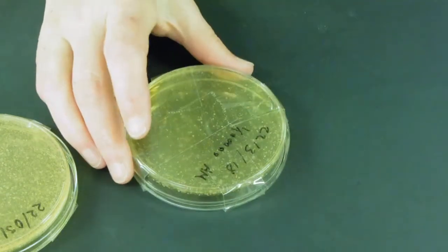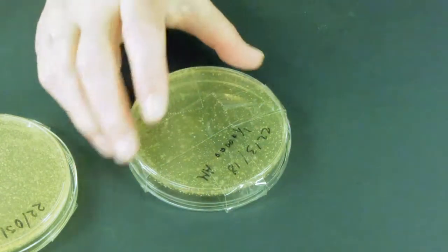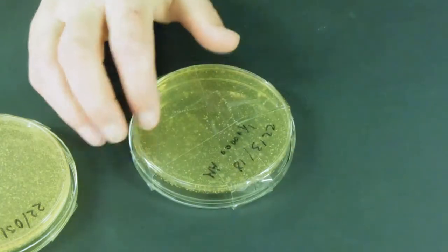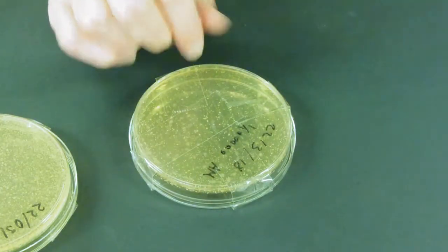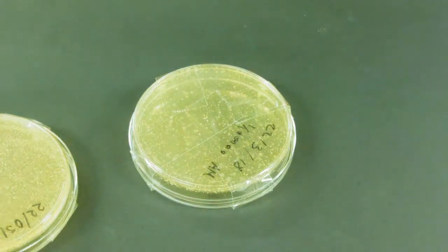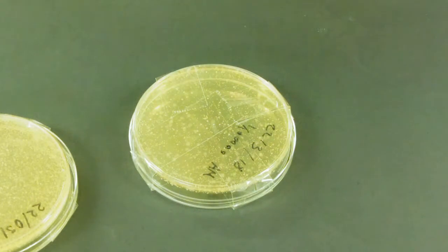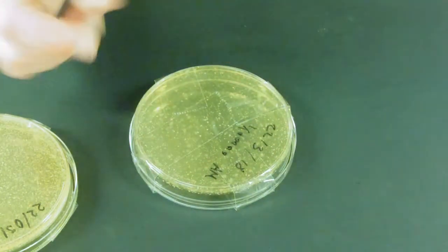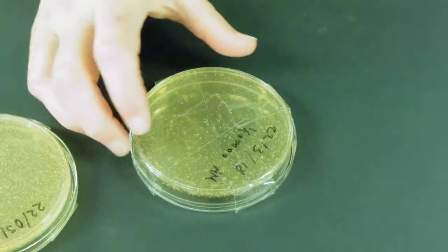What to do once you've counted them, then you need to multiply by the dilution. So, this has been diluted one in a hundred thousand. So, however many you counted, you'd need to then multiply by a hundred thousand to get right back to the start with what you had in your original culture. And, obviously, you need to know the volume, so if we put a tenth of a centimeter cubed in here, we would have to multiply by ten to get it to a centimeter cubed. We actually put one in, so we could just multiply up.